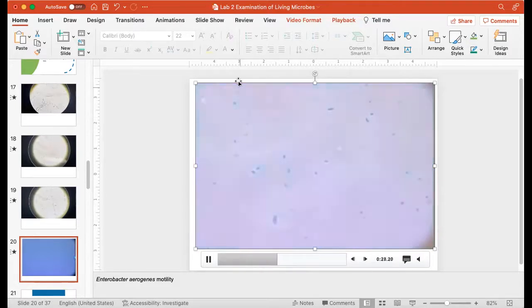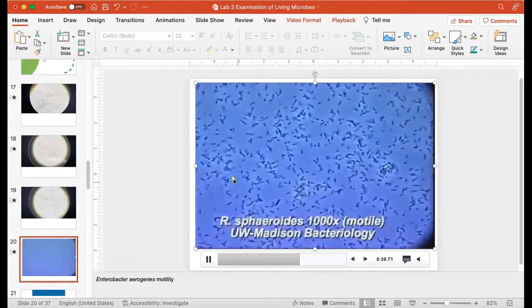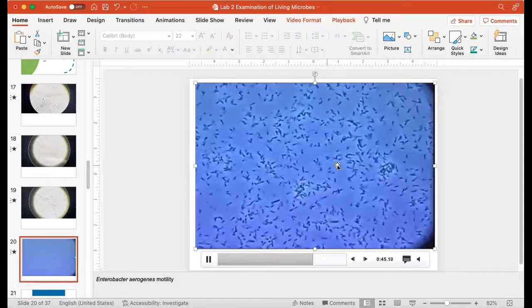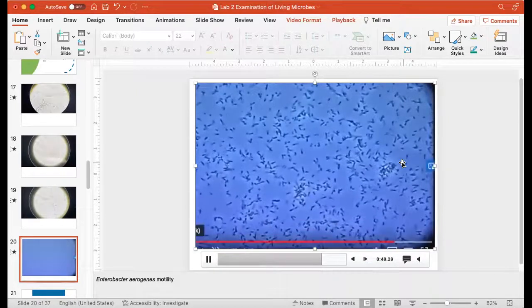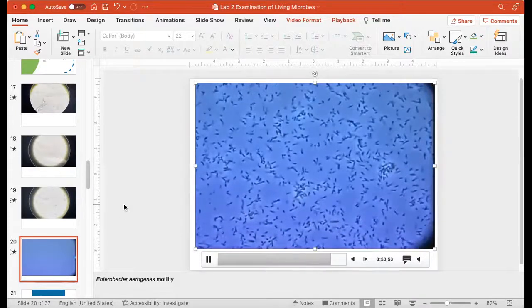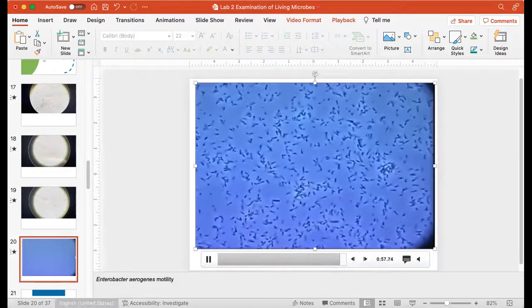It's very obvious when you have true motility, because you have cells that are traveling under their own power. So they're going in their own direction at their own speed. They're not paying attention to anything else. They're just off doing whatever they're going to do. That is motility. Very, very different from both that current movement and the Brownian movement.